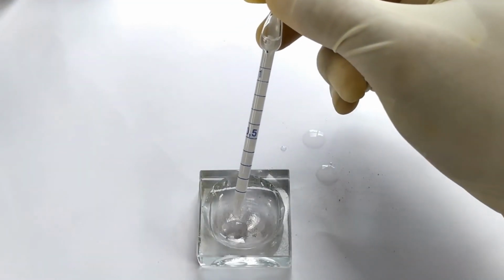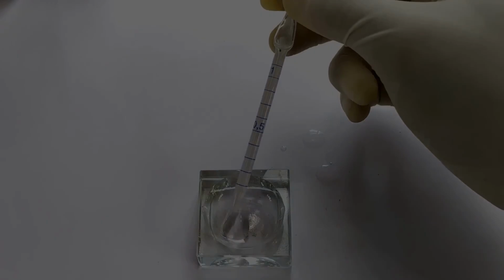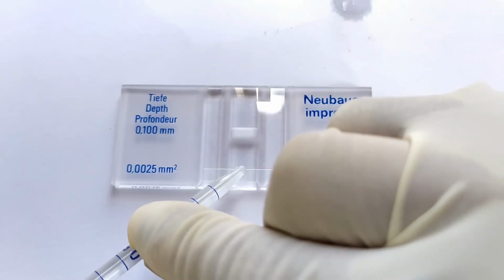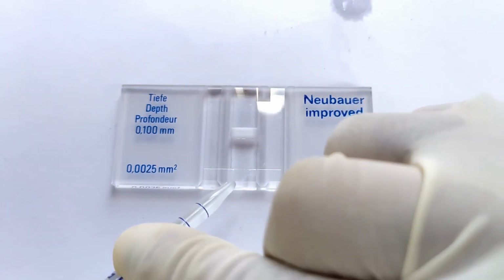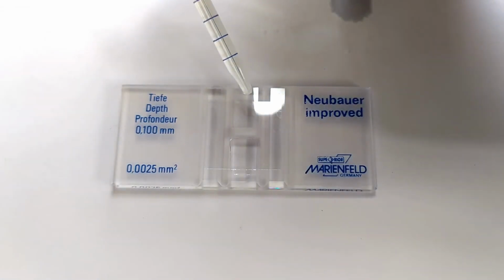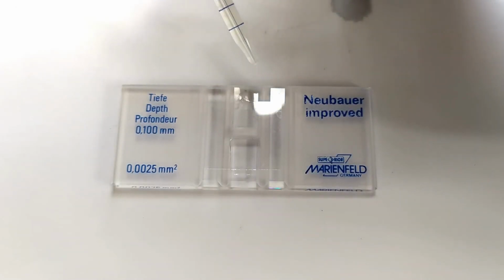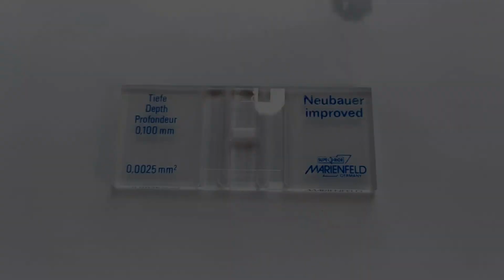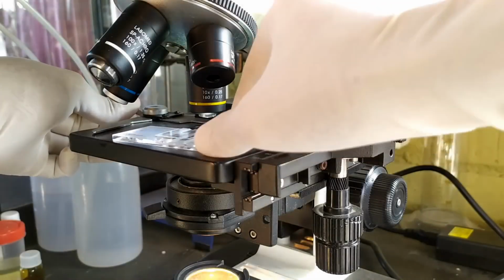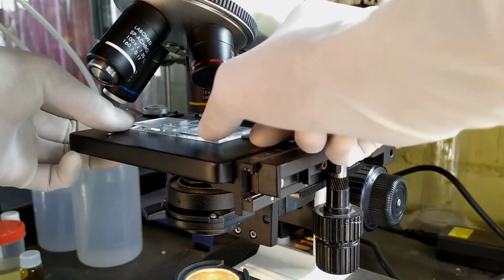Discard the first 2 to 3 drops from the pipette. Load the counting chamber with the diluted semen sample. Place the loaded chamber under the microscope and let it rest for a minute or so.